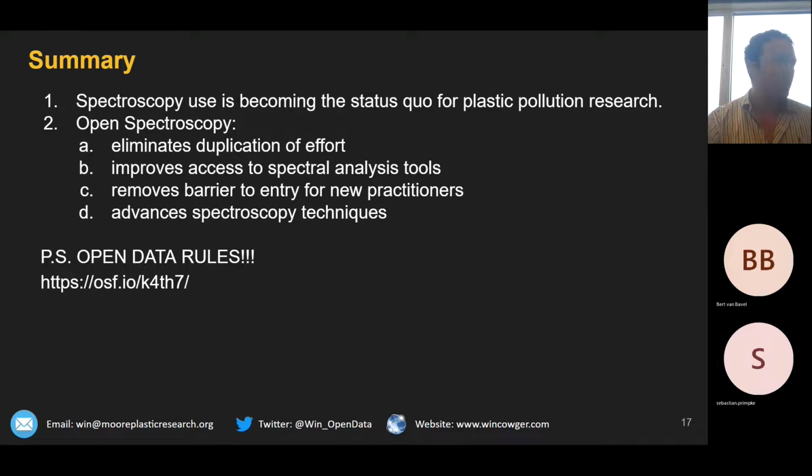Both approaches will work, and I think when you have background, especially really high background, you may need to try to use both. You may even need to try to figure out if you can create a reference database where you have that, and then also try to remove it. That happens automatically if we get a match on a lousy spectrum with a lot of background that will be uploaded in your database. So you will have a spectrum which, with a certain matching factor, will be uploaded in your database.